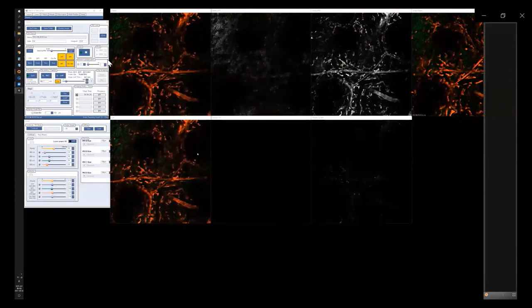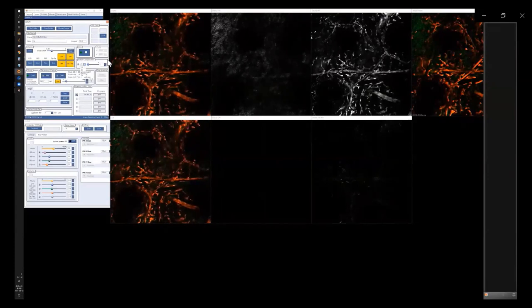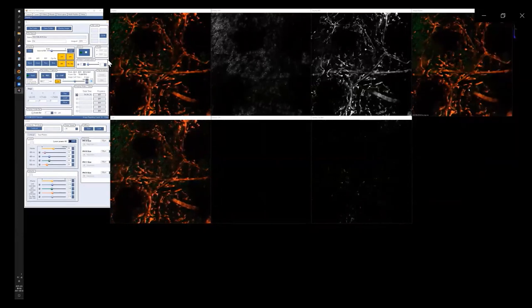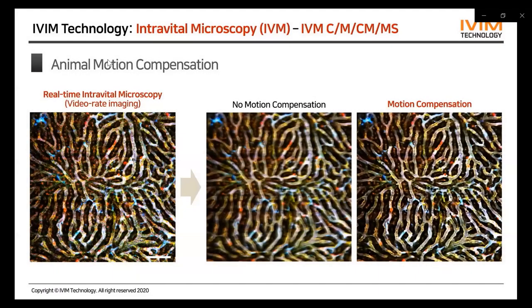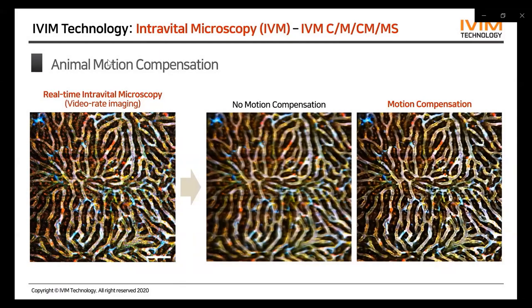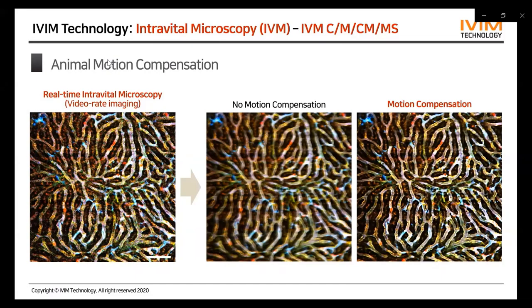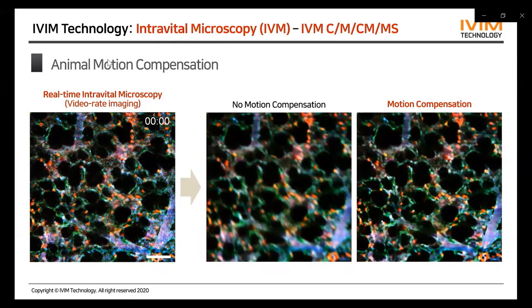For acquiring clear data from a moving animal, by checking the motion compensation function and selecting the channel for the registration reference — which normally includes some non-moving object — after capturing we can get the compensated clear image on the right. This is the result with and without motion compensation: the image without compensation looks very shifted with motion, but after compensation we get very fine and clear images.